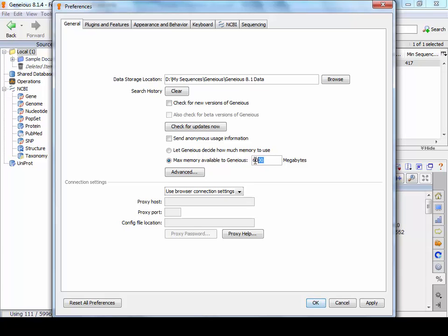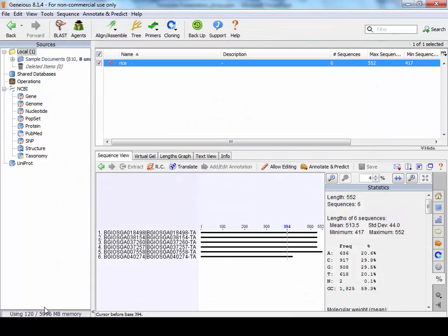But ideally, if you've got 8 gigabytes, which is preferable, set this to 6000 and you'll find that less likely the job will fail because you don't have enough RAM to run it. OK, so once you've finished all the changes, press OK and then you're good to go.